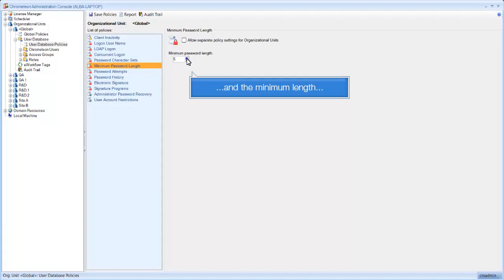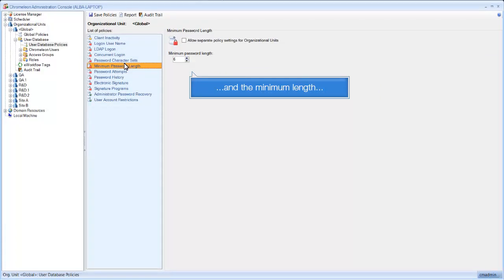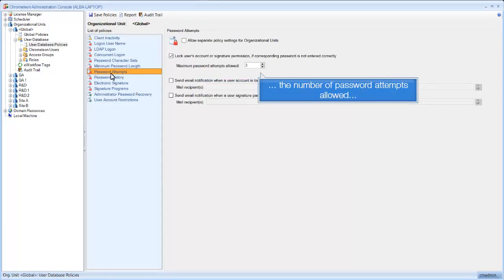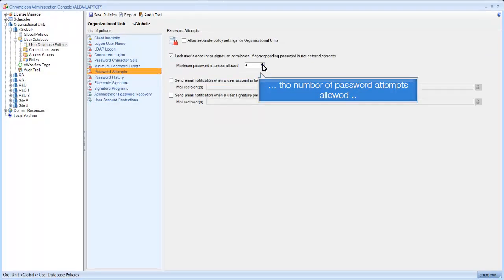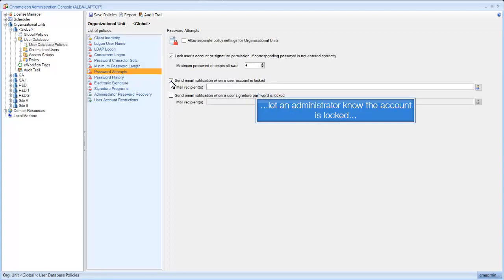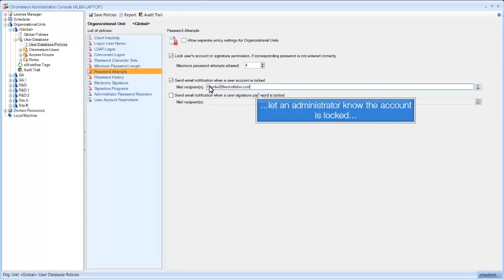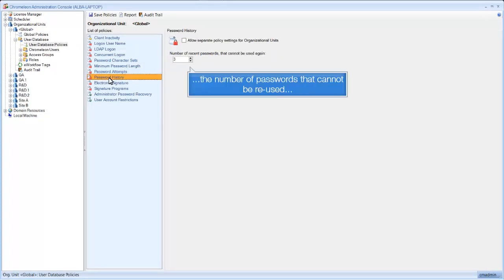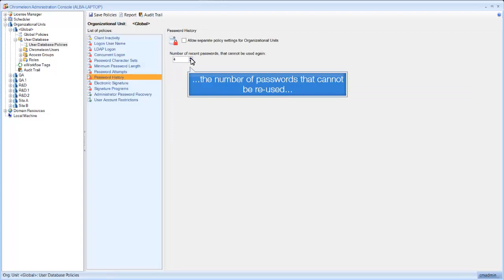And the minimum length. The number of password attempts allowed. Let an administrator know the account is locked. The number of passwords that cannot be reused.